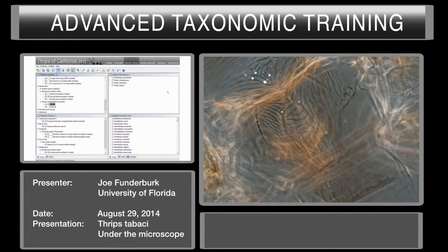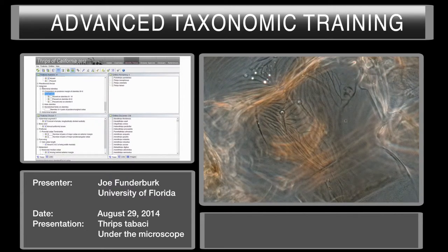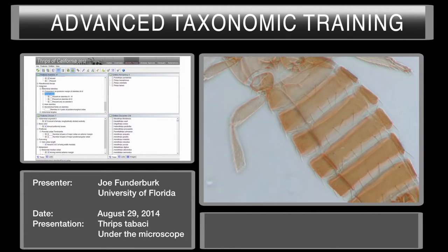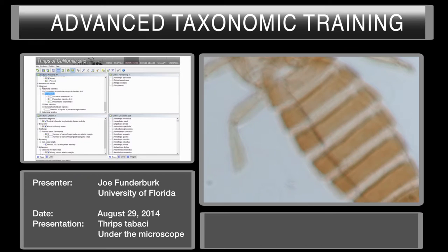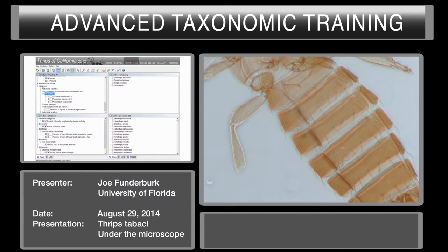We're down to four species. The next best character is discal setae on the abdomen — specifically abdominal sternites three through six. I needed to lower my magnification so we could see this. Even at this lower magnification, we don't see any discal setae; there are some marginal setae on the sternites. So I'm going to say absent.